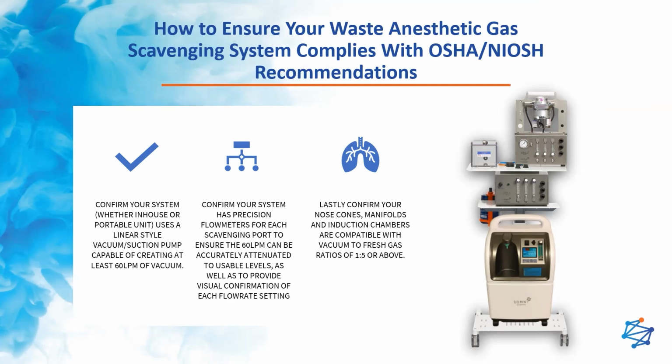And then lastly, just confirming your anesthesia accessories that we talked about in this presentation, whether that's the nose cones or the induction chambers, that they are compatible with an active style scavenging system. If you're using a passive style accessory, they will not be as effective, and you may under anesthetize the animal or over anesthetize them, depending on if you're having to turn up the amount of agent that you're delivering.